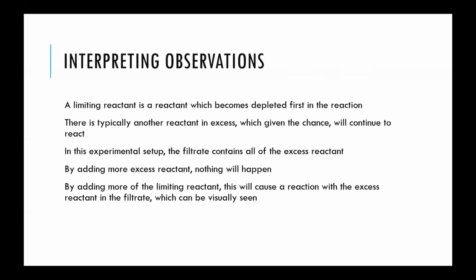That would be a qualitative observation. You're just figuring out what is the limiting reagent. And in that second reaction, the one specifically with calcium chloride and sodium hydroxide, you're getting a number. And that would be a quantitative analysis where you're looking at the amount, the specific amount. But overall, you're determining what is the limiting reagent for both of those different reactions.